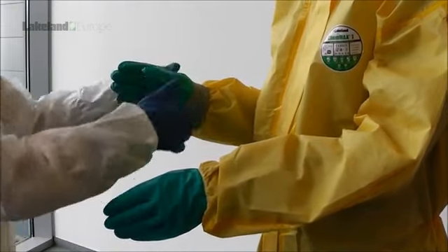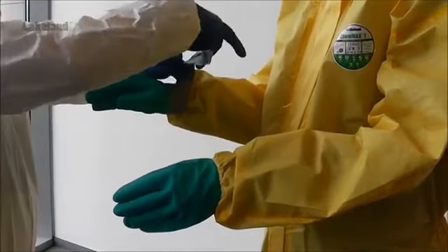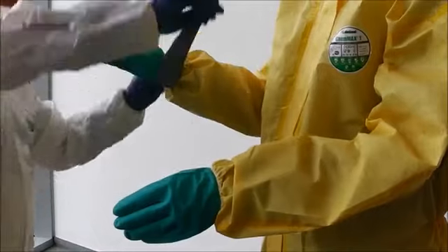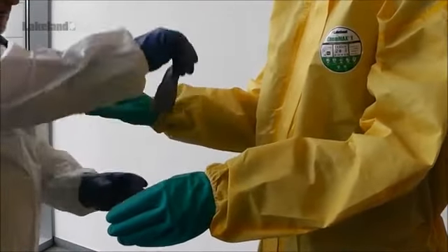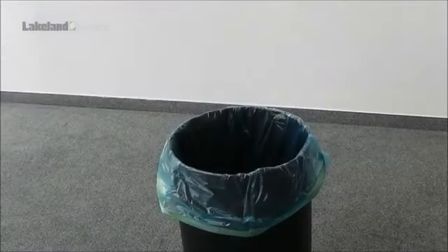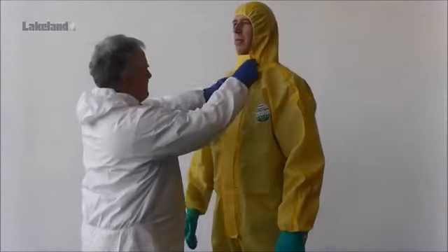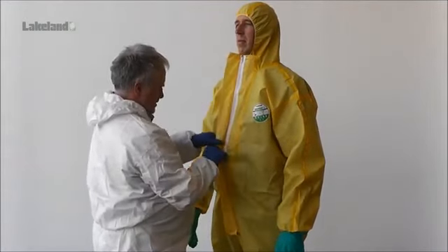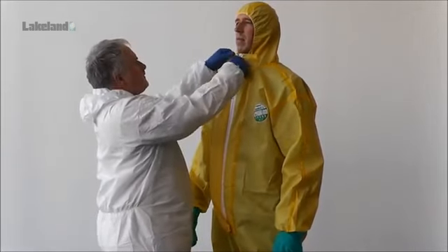Essentially, doffing of the garment is the reverse of the donning process. First, the tape around the mask and gloves, if used, is removed. Do not remove the gloves at this stage. A suitable disposal bag should be used to contain the tape, gloves and garment immediately on removal. Again, it is essential to use an assistant for this operation. But in this case, because the suit might be contaminated, the assistant should also wear protective equipment.